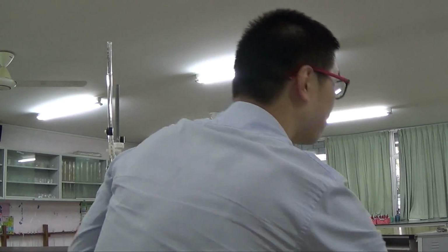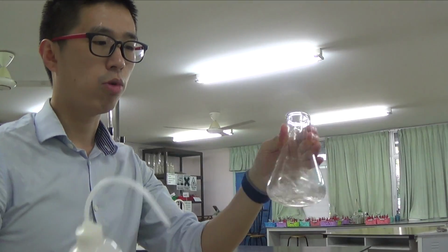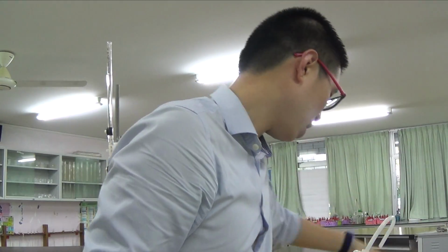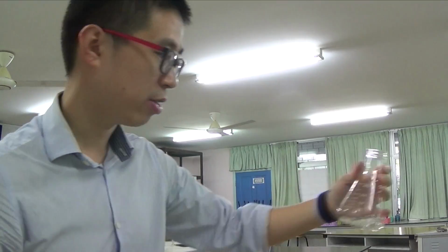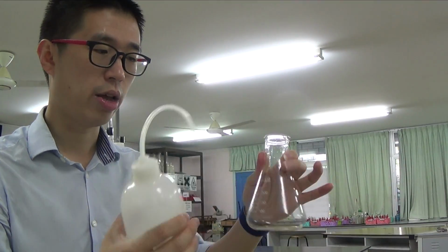I have my conical flask, so I just need to rinse it with a little bit of distilled water. By right, you can wash it with tap water and then just rinse it with distilled water entirely. It's okay to have water left over in the conical flask, because whatever you pipette out is going to be an exact amount that's going to go into the conical flask.